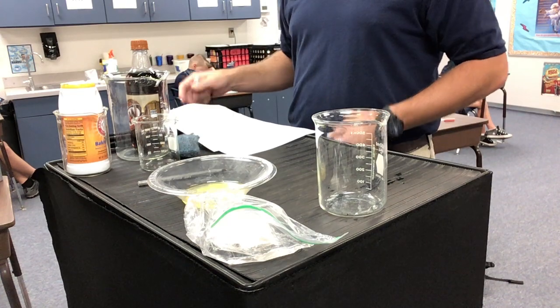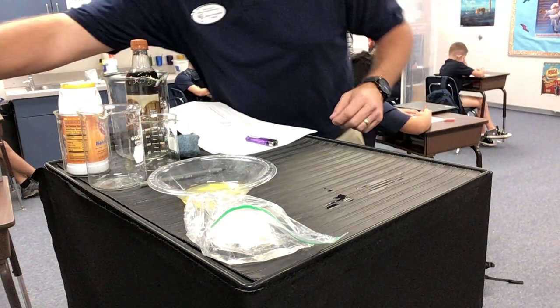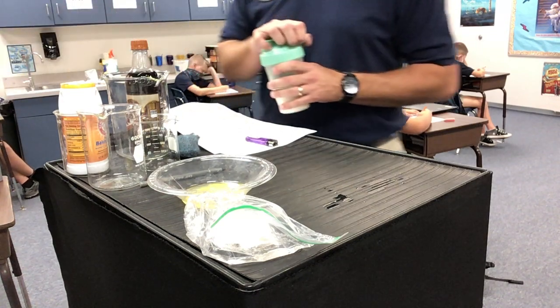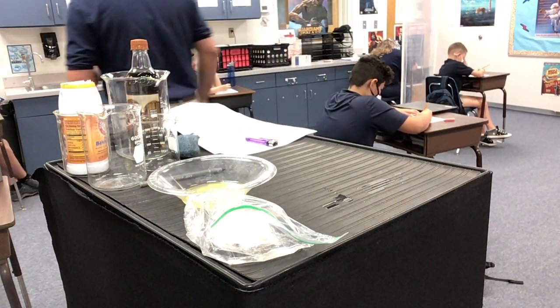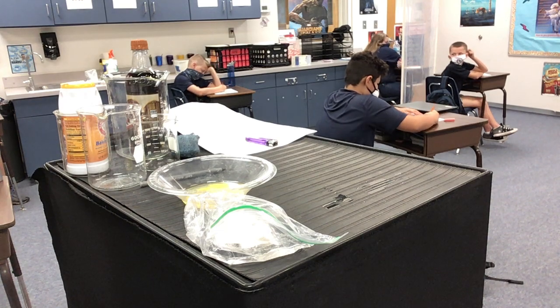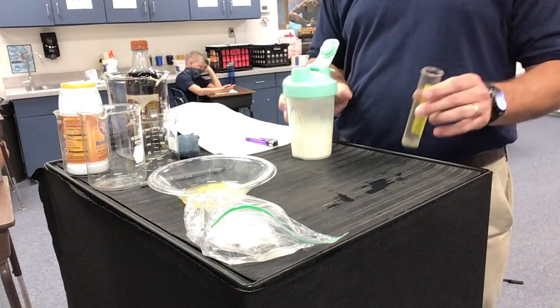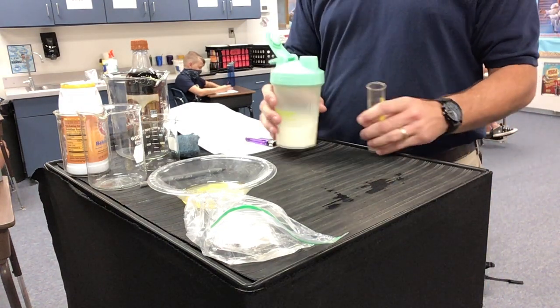Next one. Okay, so I'm going to take milk, real simple.